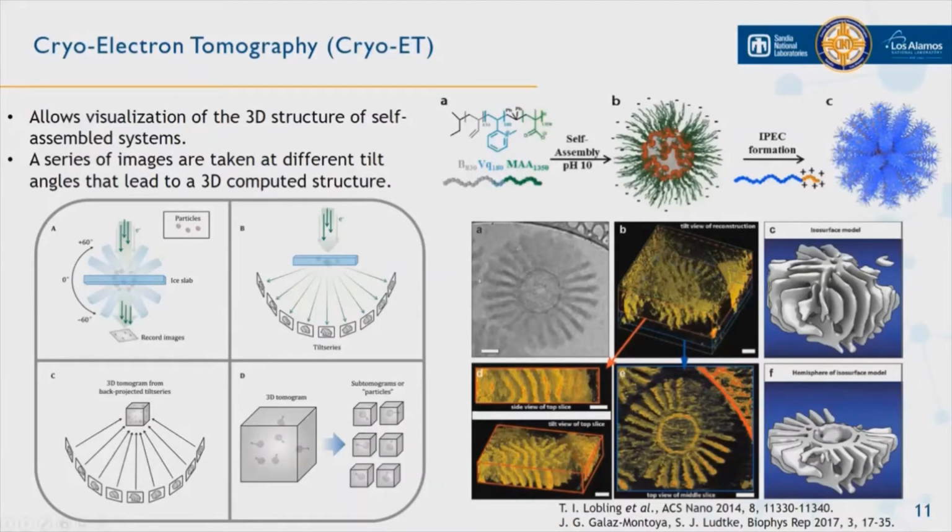So cryo-TEM was used to identify the structure at each step, but of course here we are looking at a 2D projection. By carrying out a tilt series and 3D reconstruction, the authors were able to observe a rather surprising structure that consisted of a complex arrangement of vertical lamella. The structure kind of resembles a wind turbine, with the lamella becoming more bent as they project away from the particle core.